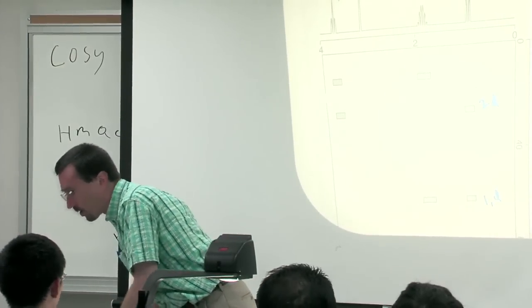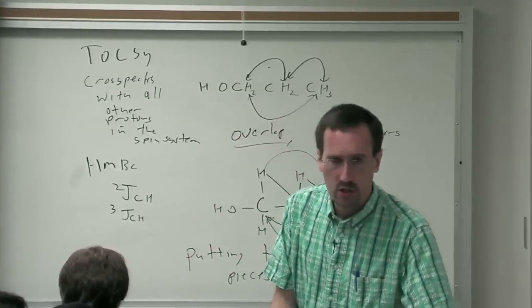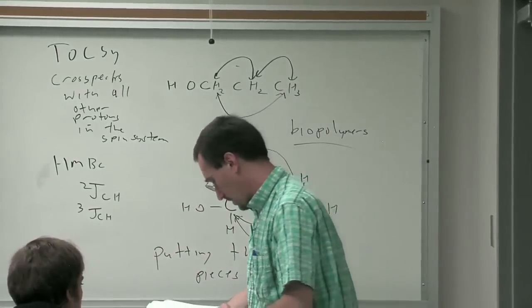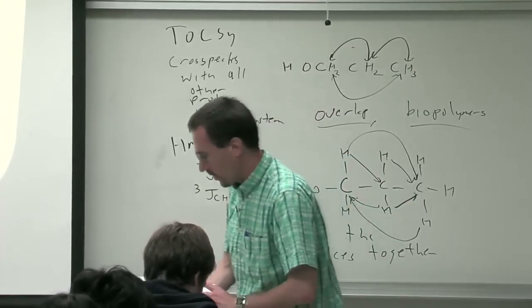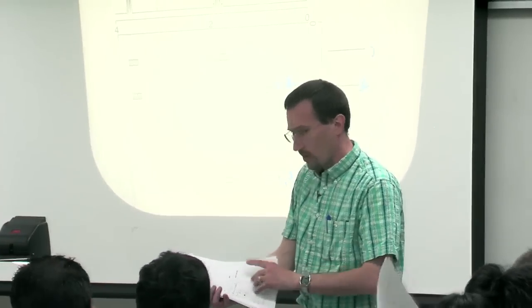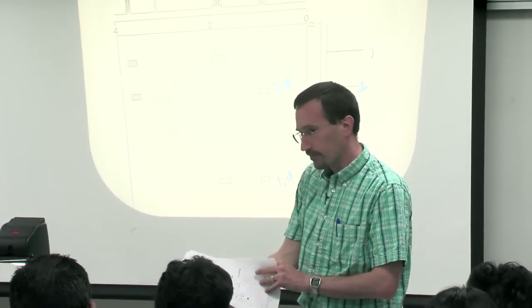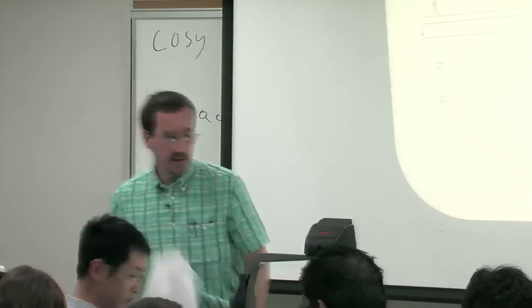We're going to spend a week or two not using HMBC. What I do want to start us out with now is an example with HMQC and COSY, and show you how beautifully they work together, and show you how I solve a simple problem. This is a problem from not this week's homework, but next week's homework, so it'll be sort of a demo problem for you. And if anyone didn't get one, there's enough to go around.